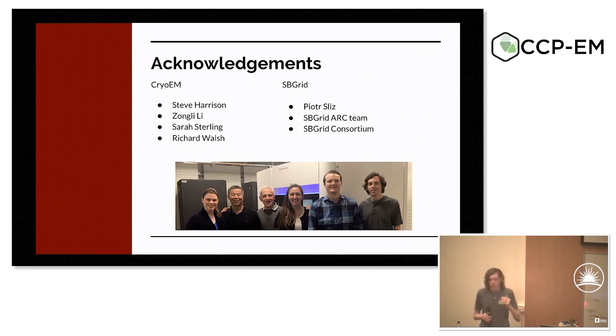When it comes to steps later down the pipeline, then 2D class selection is really the problem. How you select the well-aligning particles to feed into the later steps is still where, at the moment, a human can open it, within 4 seconds, pick out all the good classes and be done. There aren't good metrics. You can't really use even angular accuracy, accuracy of translations. There are no good metrics that will work for every system. The ones that work well for good data tend to fail for really terrible data.